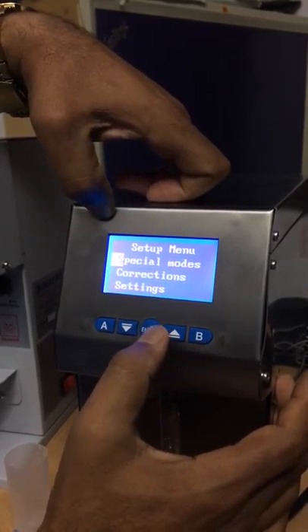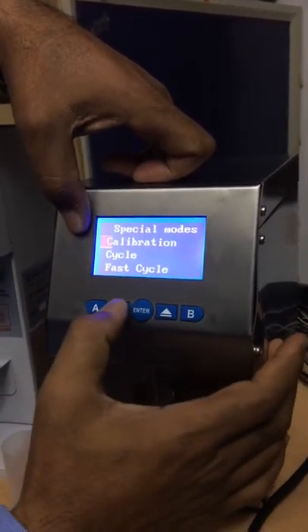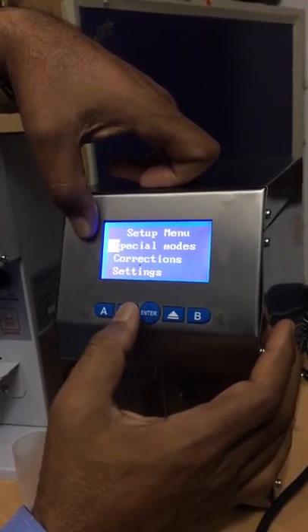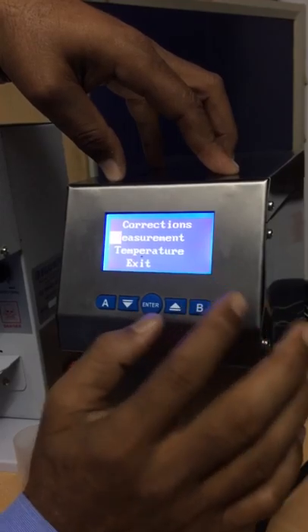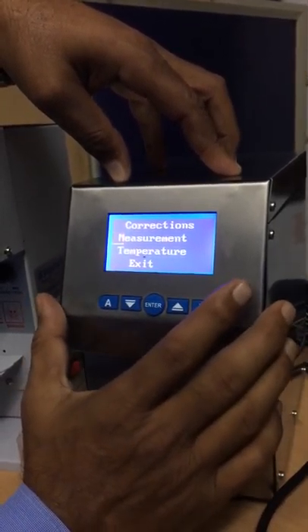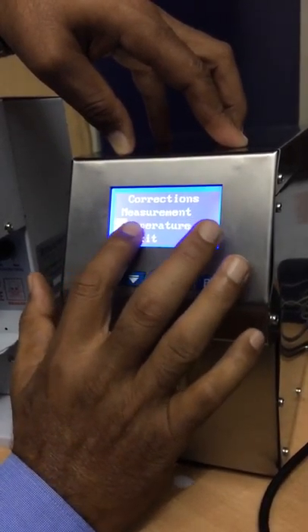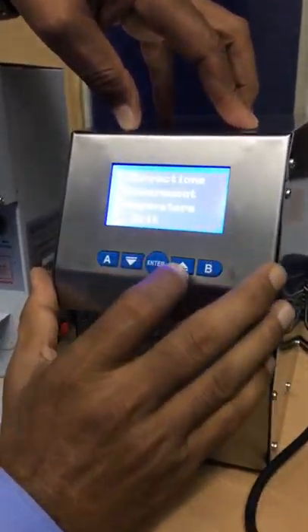If you go to Special Mode, you can calibrate, make a cycle, or run a past cycle — this is for cleaning purposes. Many options are there; you can see them in the manual supplied with the machine. Under Corrections, if the reading differs when you compare with Gerber, you can make a correction here. Temperature correction is also available if the temperature shown is not accurate.